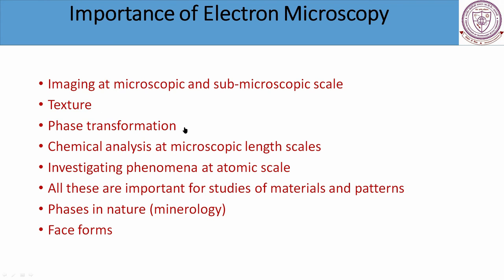You can have phase transformation studies. You can have chemical analysis at microscopic length scale. This demonstration I have given you for the scanning electron microscope by the EDX signal, and for the transmission electron microscope in the STEM mode. You can investigate phenomena at atomic scale. All these are important for studies of materials.